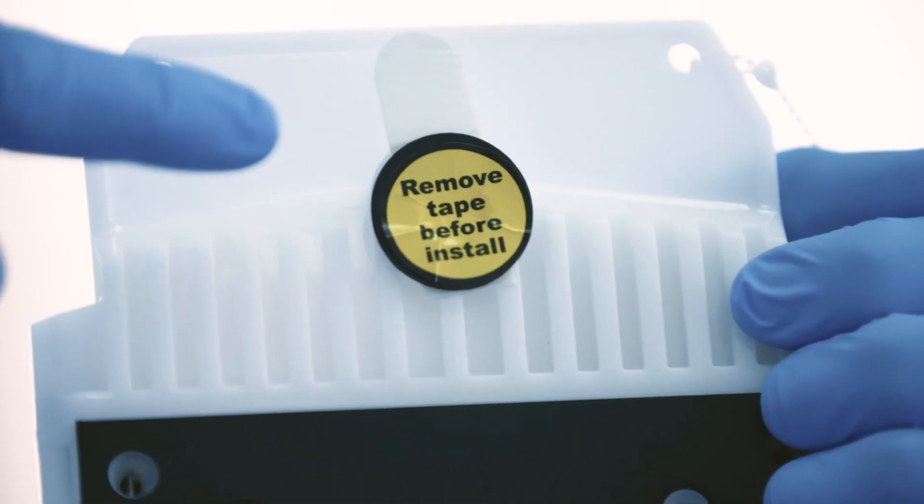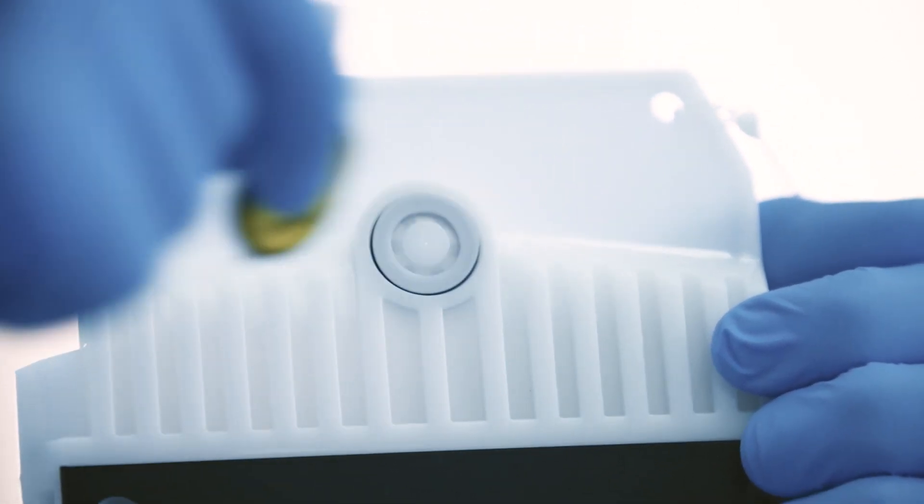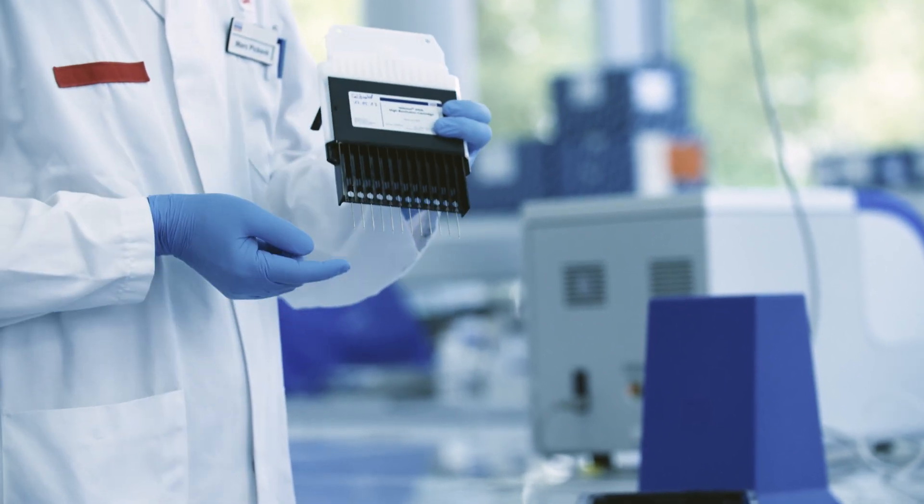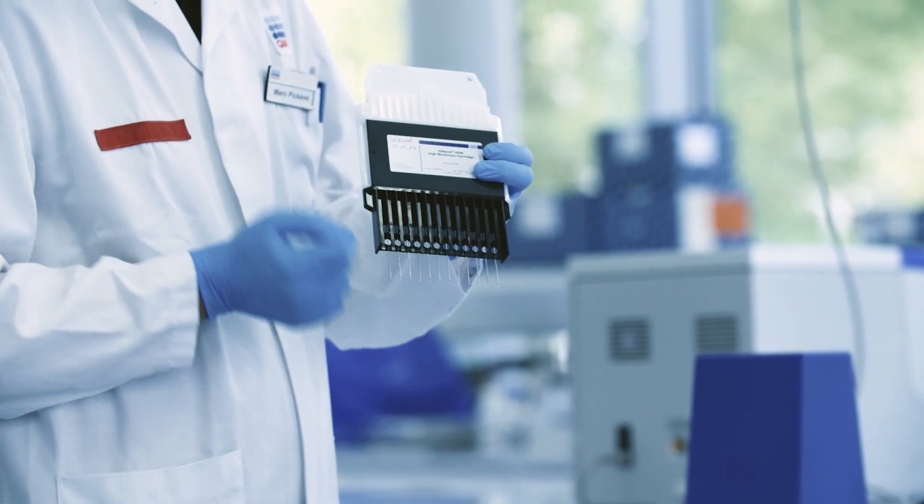Nitrogen pressure is applied via the purge port, enabling the instrument to replace used gel from the previous run with fresh gel for the next run. Analytes are loaded into the gel capillaries and separated by size under application of an electric field.